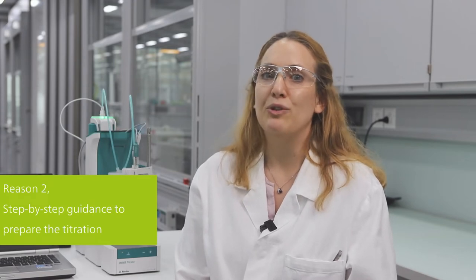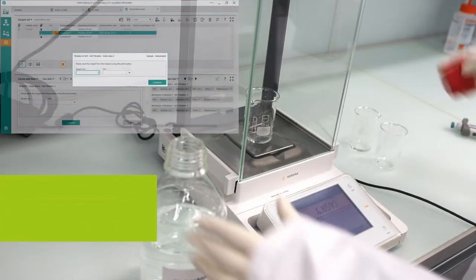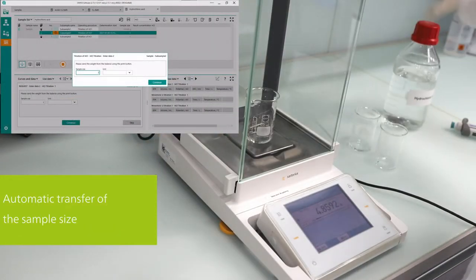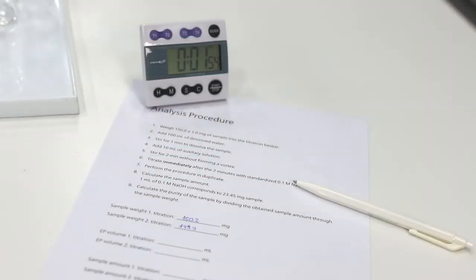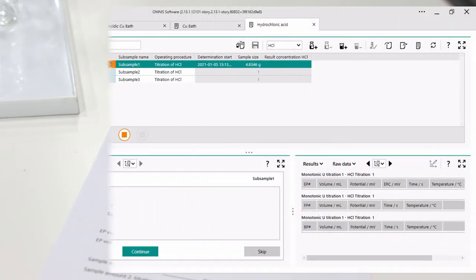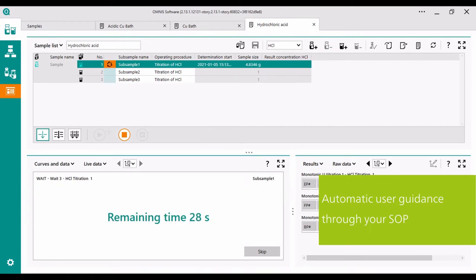My second reason to switch to automatic titration is the step-by-step guidance provided by my autotitrator. Forgetting to note down the sample size or adding an auxiliary solution are a thing of the past. With the balance connected to the titration system, I send the sample size with the push of a button to the titrator. Following an SOP on an automatic titrator is very easy — the system guides you step-by-step, including waiting times, adjustment of stirring speed, and more.